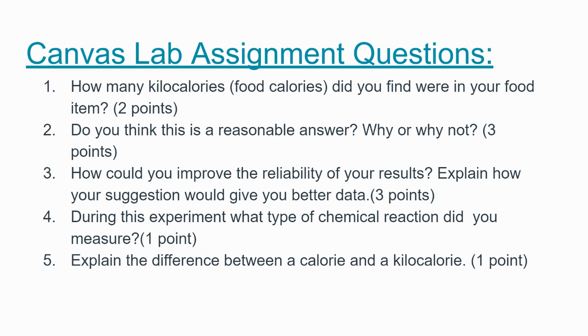And then this one, what type of chemical reaction did you measure? What did we measure? What kind of reaction is this? What type of reaction is it? Combustion. Good, it's a combustion reaction, good.